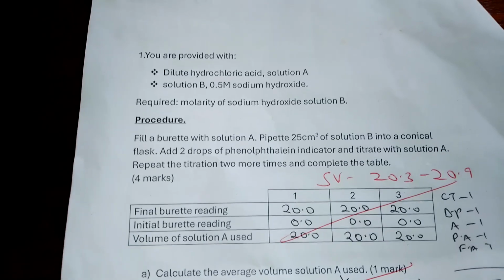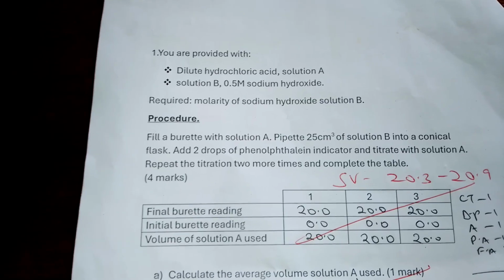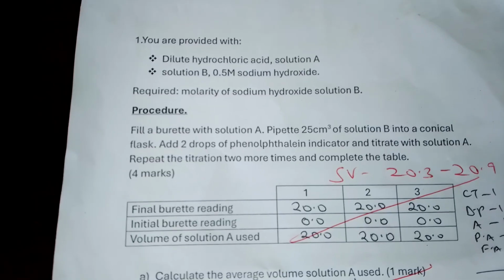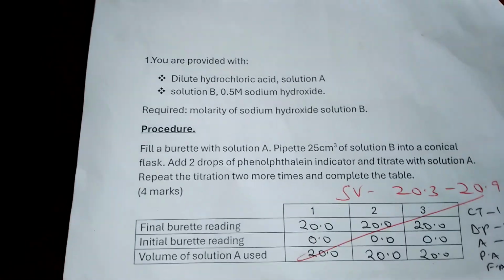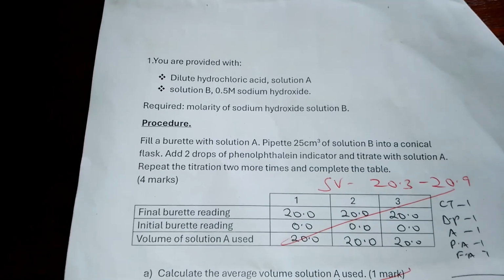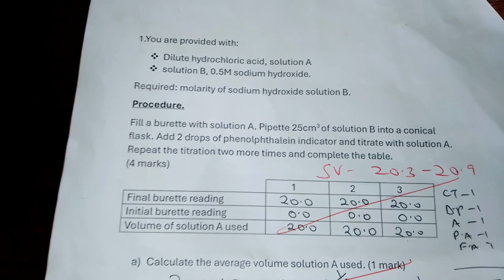So I will be asking questions, and at the same time I explain how those questions are supposed to be answered. So straight away we start the procedure. You are provided with the dilute hydrochloric acid solution A, and then we also have solution B. Solution B is 0.5 molar sodium hydroxide. You are required to find the molarity of sodium hydroxide solution B.